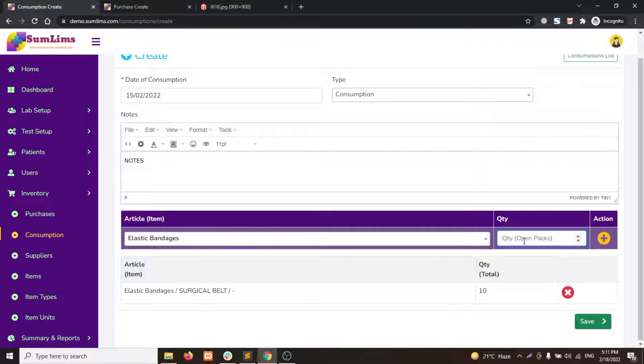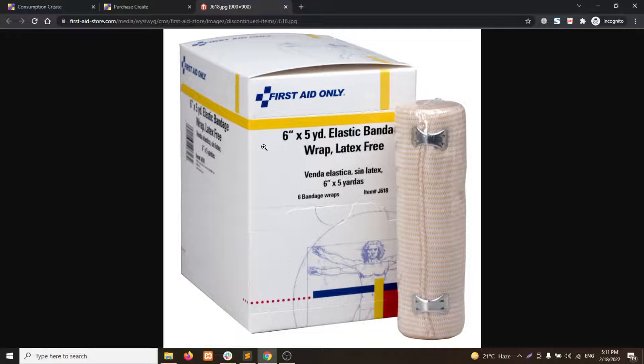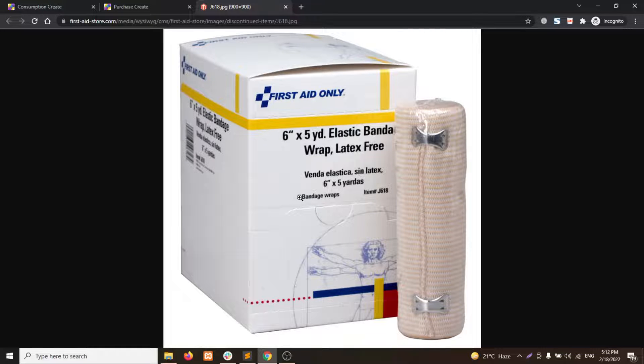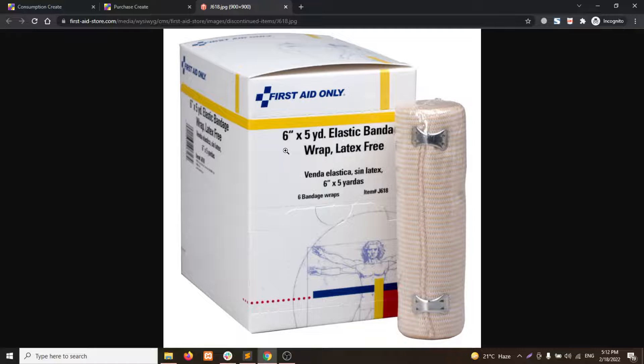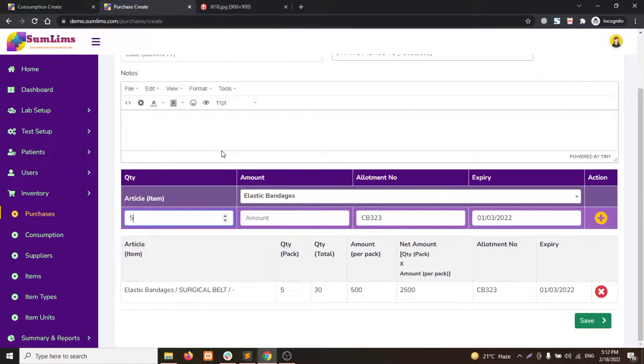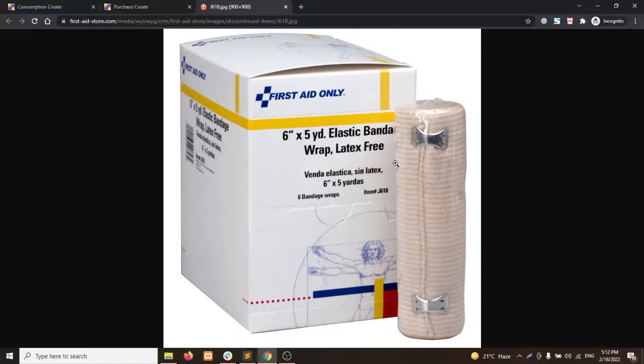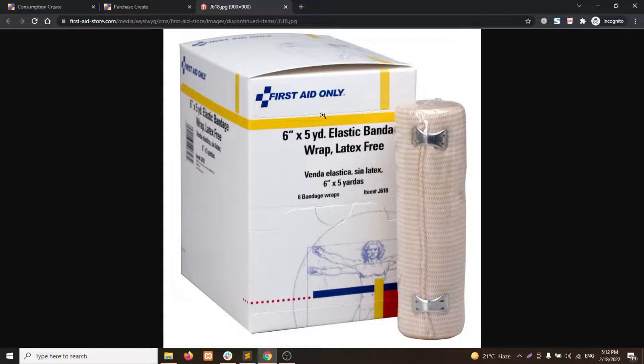To explain it further, look at here. We see that this wrapper has six bandages in it. This is convenient to use when we are saving the purchase. But when we are using, consuming, or wasting the item, we cannot write down the complete box.